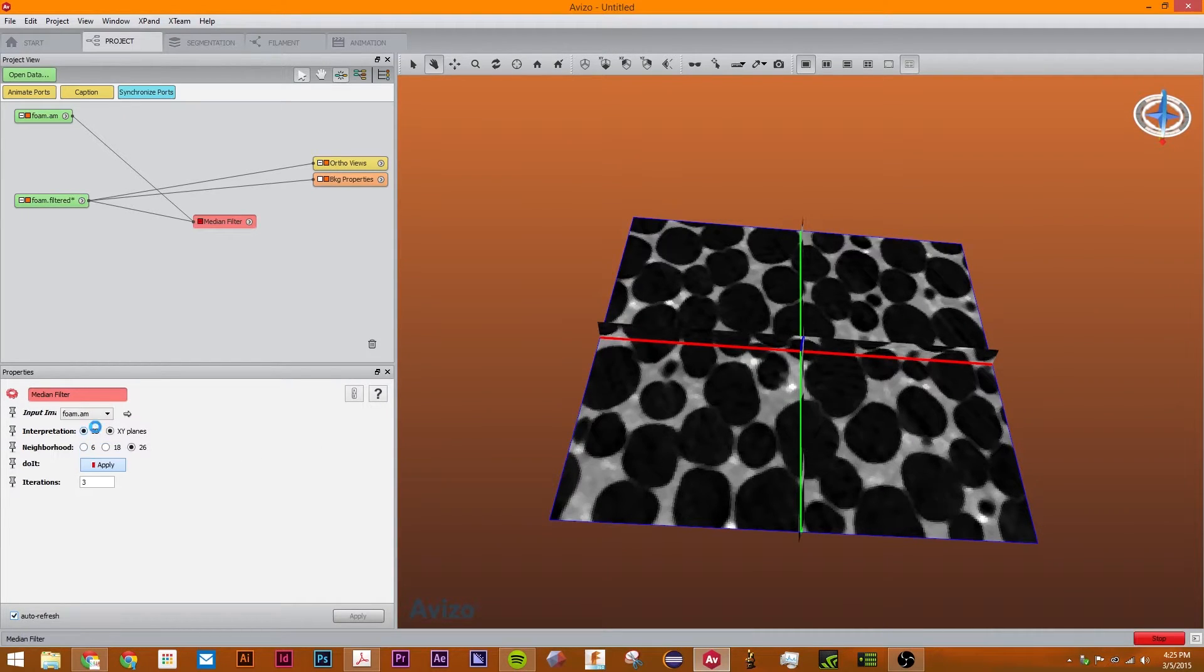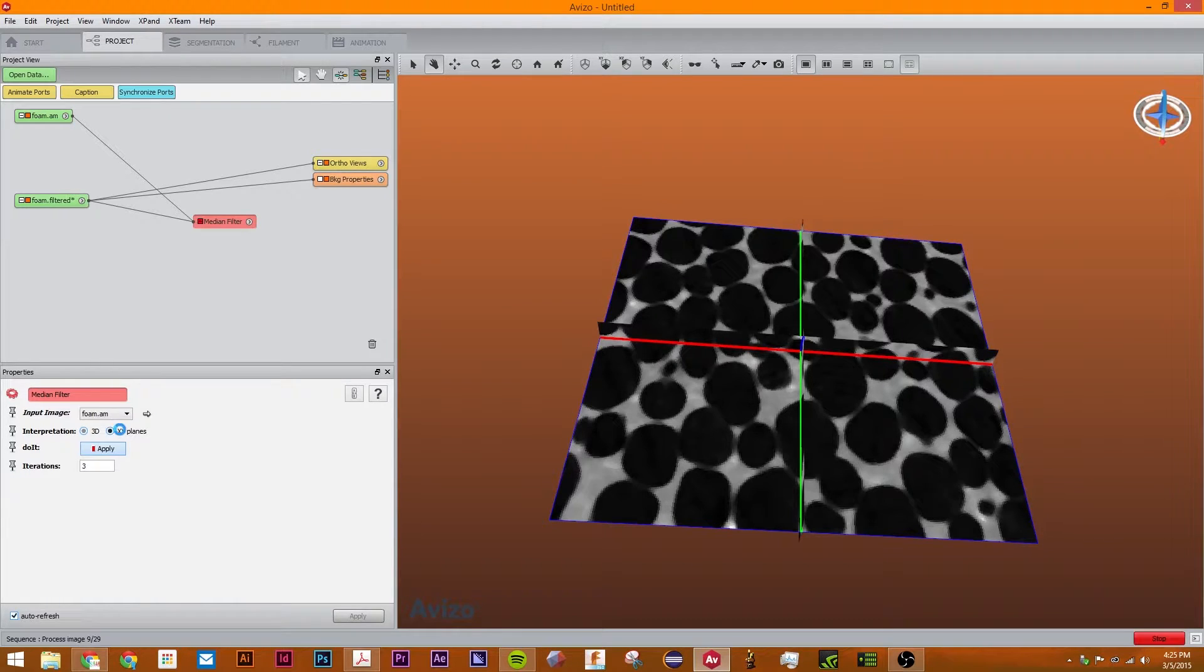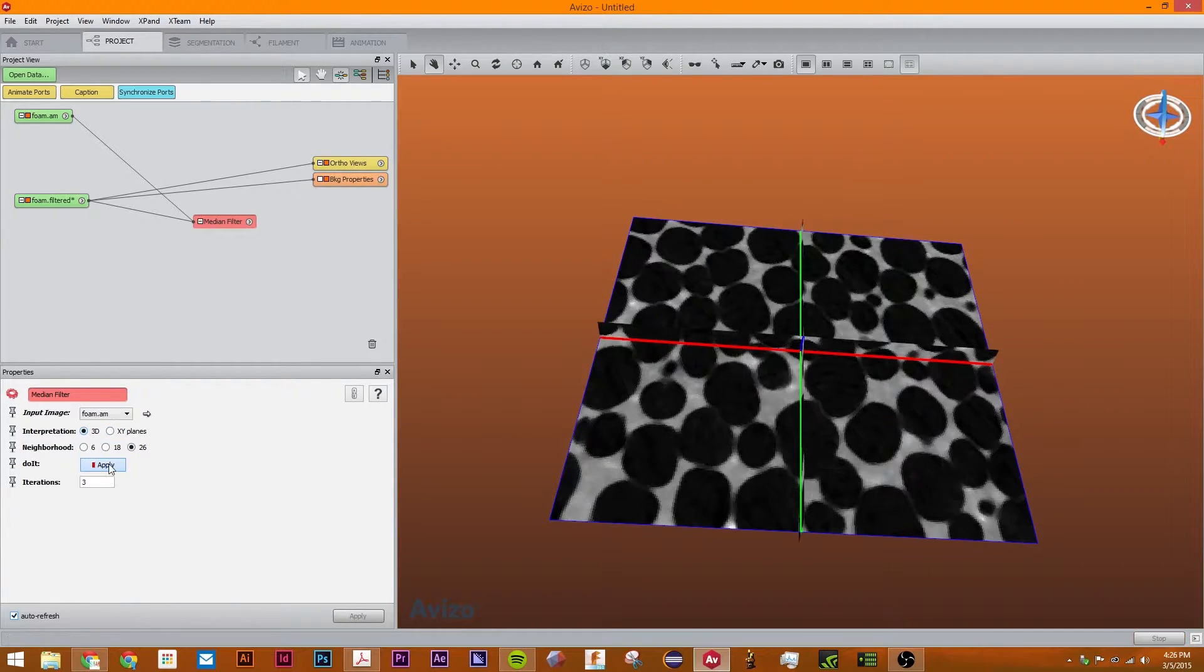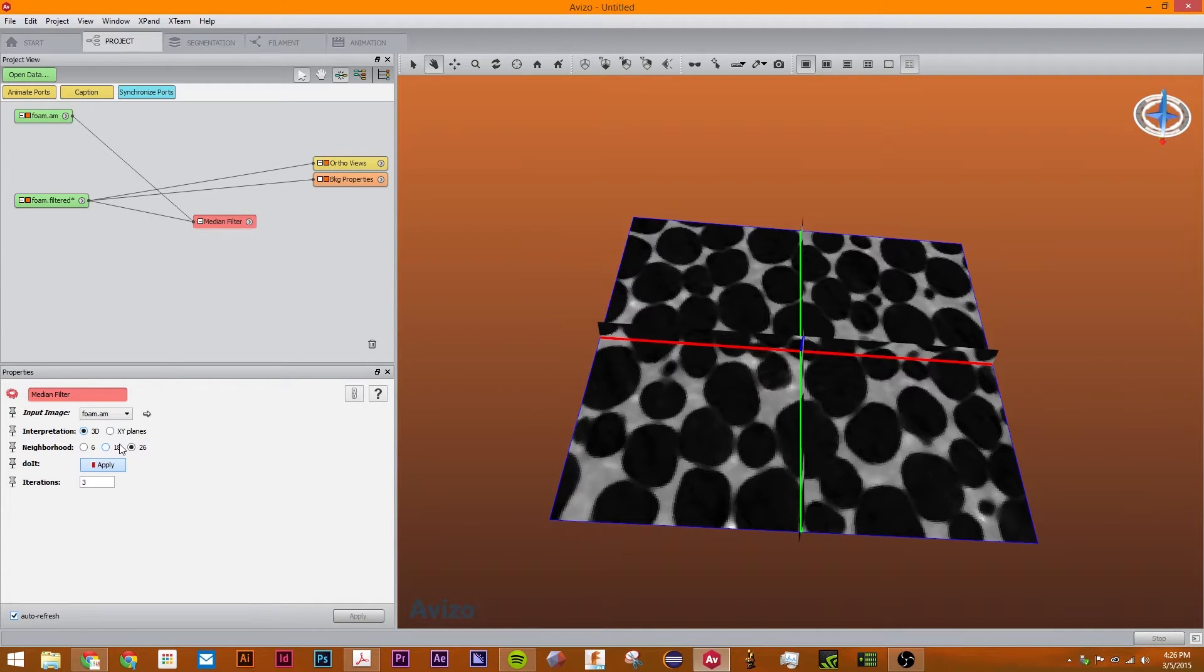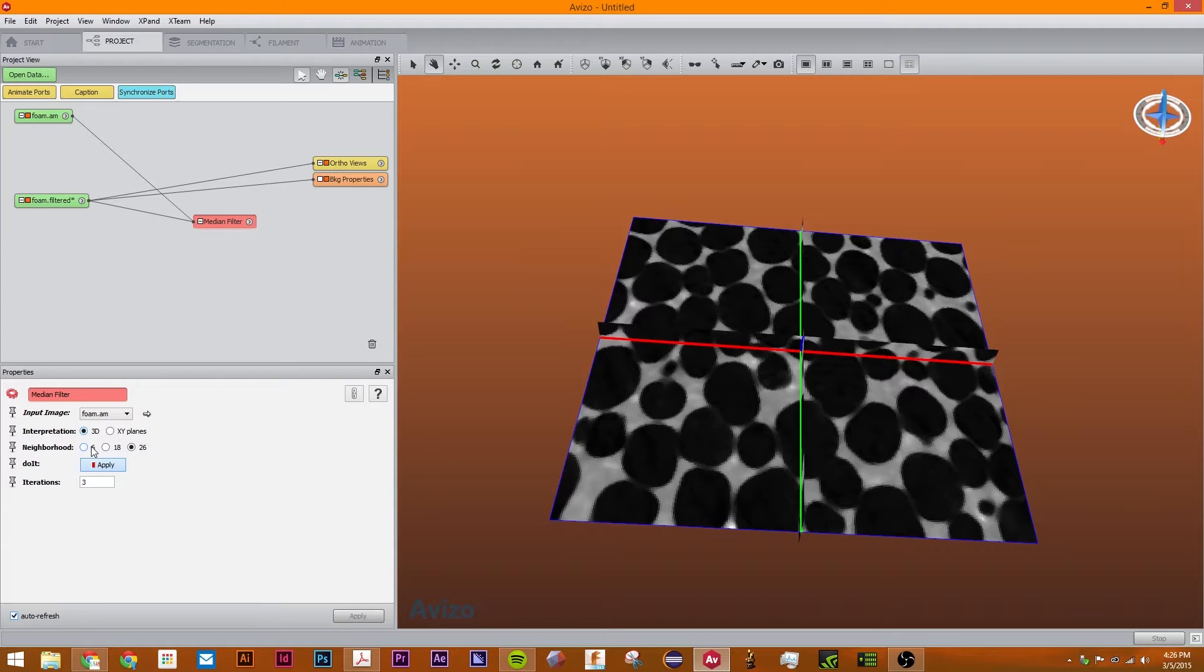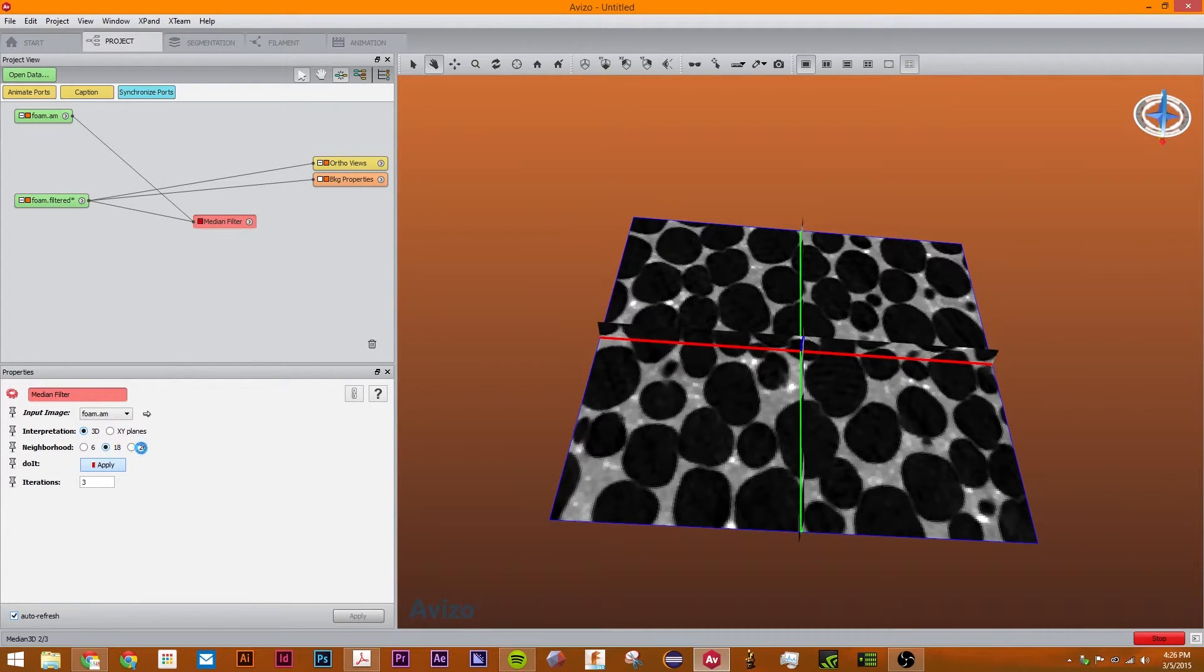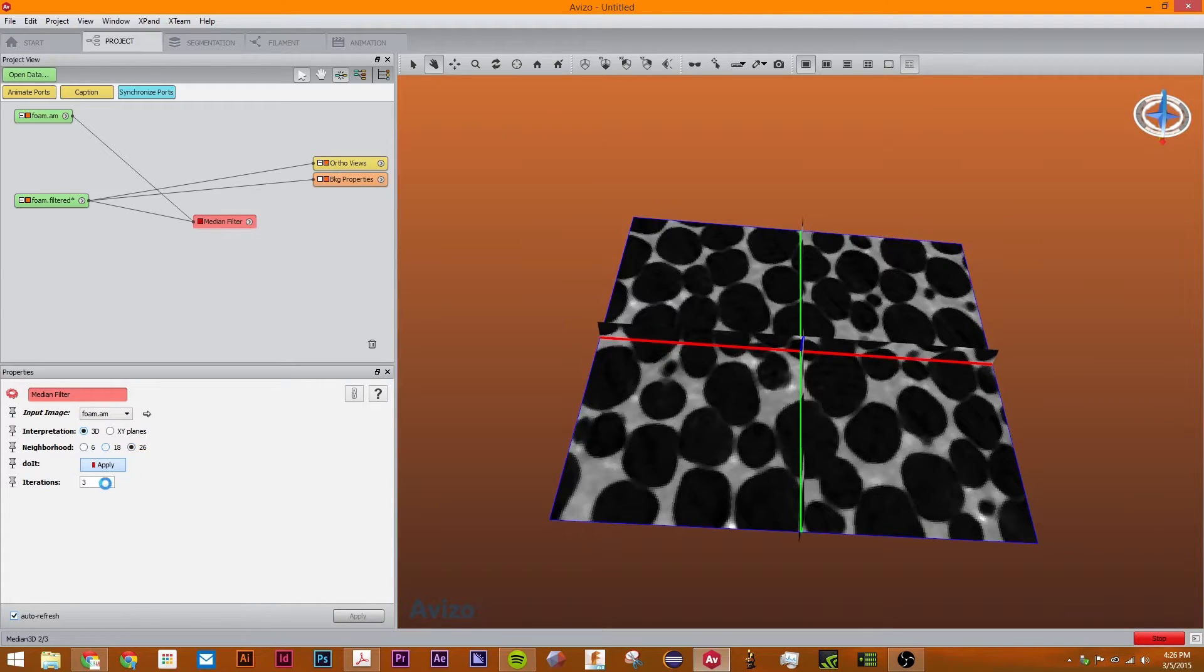So here's the difference. 3D definitely looks better but it takes a tiny bit longer to process. This neighborhood is how many voxels it will process. You can process 6 which gives you the least smoothing, 18 more, or 26 which has the most.